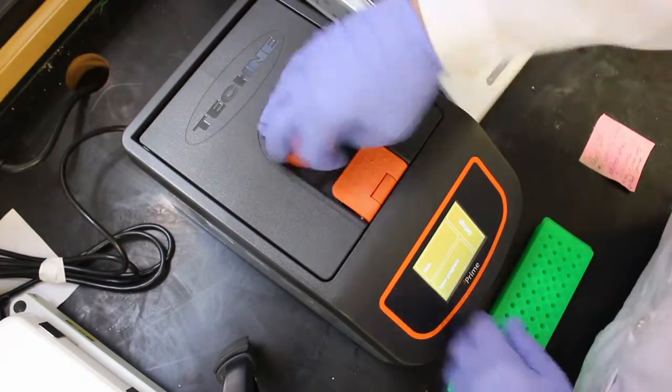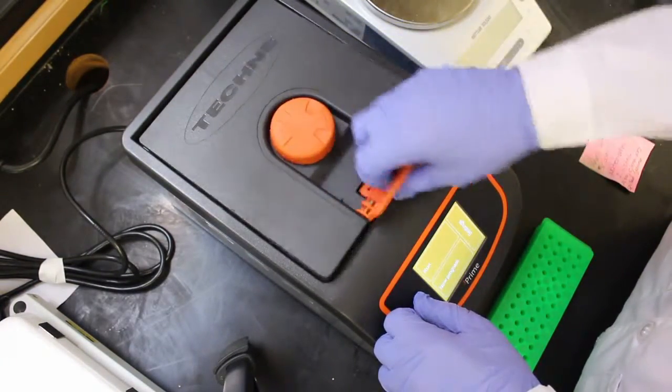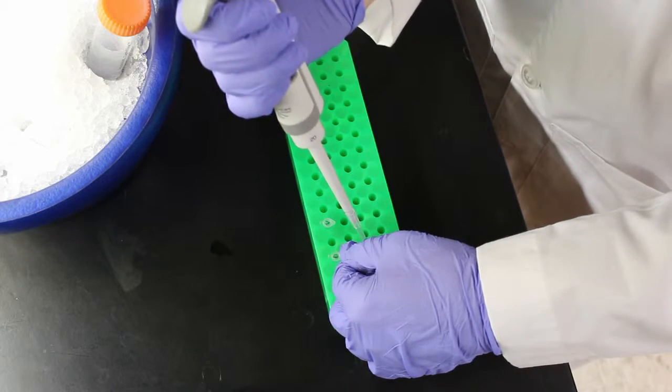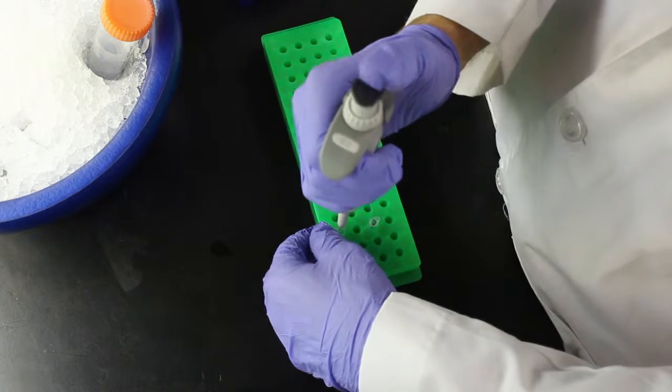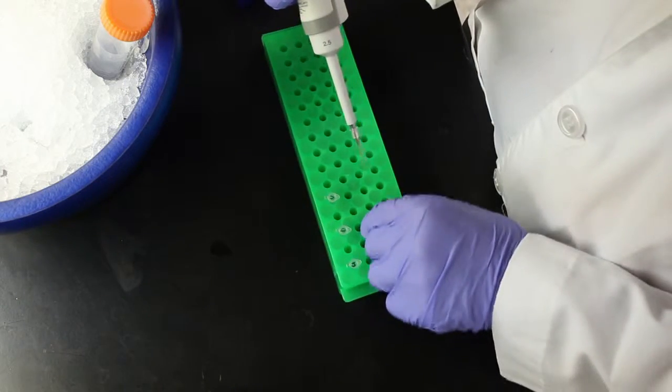Samples may be stored at this point at negative 20 degrees Celsius if needed. To ligate, add 2 microliters of each of the three digestion mixtures to 11 microliters of water in a clean 0.2 milliliter tube.